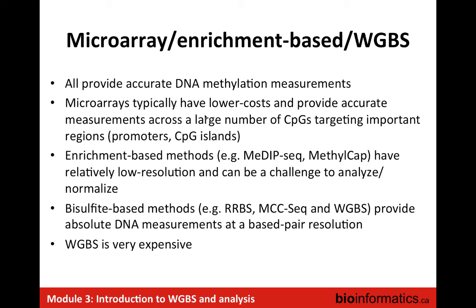to remove. And finally, with whole genome bisulfite sequencing, the main limitation is really the cost. But as the costs go down, there's a good chance that this will really become the method of choice for this type of profiling, especially given that you're not restricting to specific regions of the genome, so you're really doing an unbiased survey of what's happening.